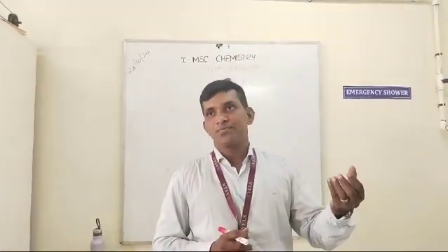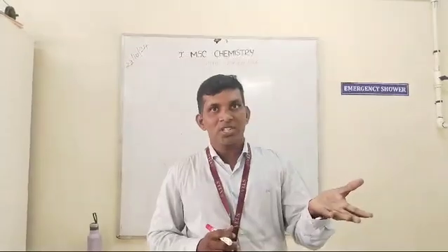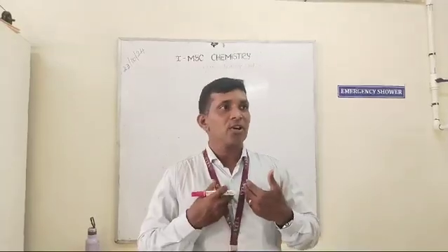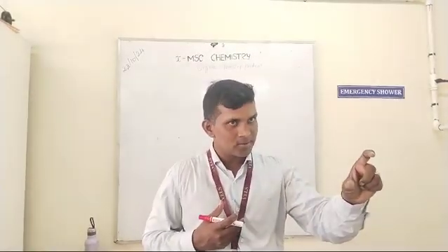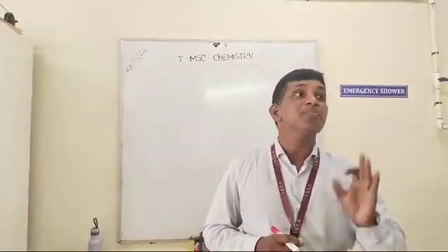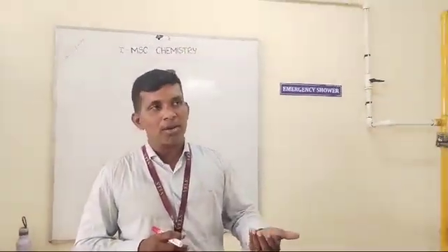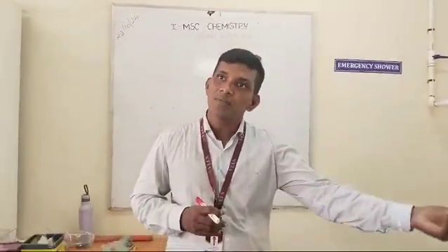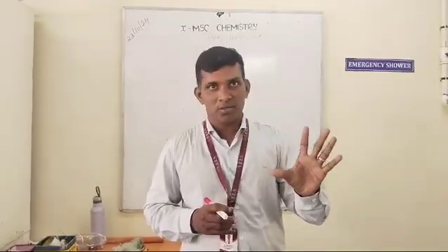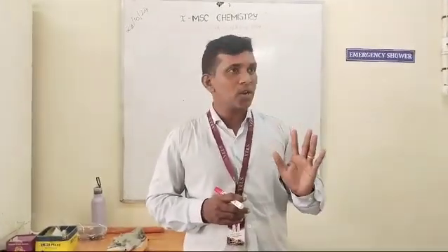Next, what you have to do, you separate the solution. In that solution, or you just evaporate the solution, that's your choice. For my knowledge, I am taking the diethyl ether solution. You just add 10% sodium bicarbonate solution. How can we prepare 10%? Take 10 gram of sodium bicarbonate in 100 ml of water, or 1 gram of sodium bicarbonate in 10 ml of water. That solution is a 10% sodium bicarbonate solution. Okay. To that mixture, you add this sodium bicarbonate.